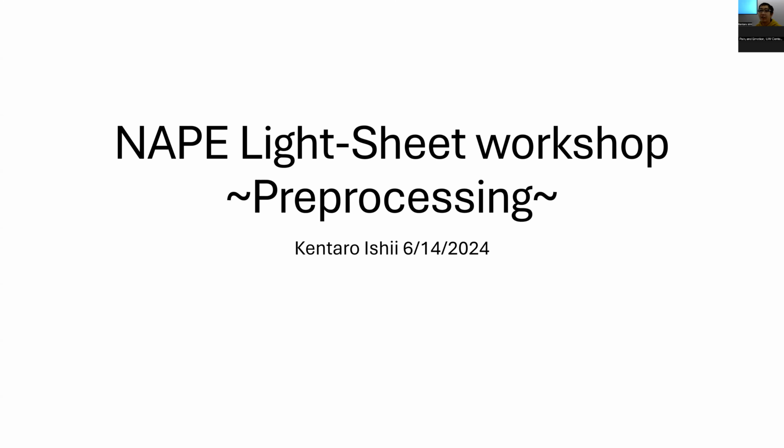It requires a certain understanding of efficient computation and image processing. In some cases, you also need some knowledge about specific hardware. So the purpose of this portion of the workshop is to offer you as simple a pipeline as possible that you can just put your data into, change some variables, and at least get something out of it. We hope that you don't have to worry too much about setting up the system, and you can go directly into the data and directly into troubleshooting, at least troubleshooting the quality of the data.